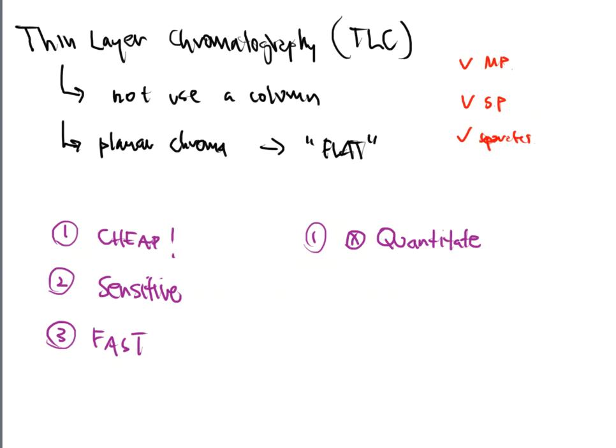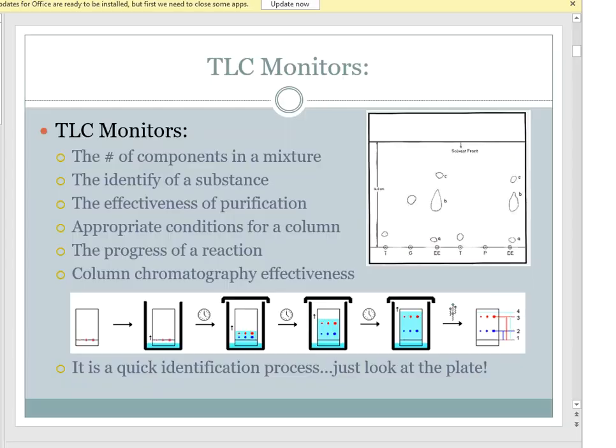So maybe just a few minutes ago, you heard me babble on and on about TLC and what TLC is and how TLC is different than traditional column chromatography. All right, so we need to go on and talk about more aspects of TLC. The first thing I want to say is that TLC is used for multiple reasons.